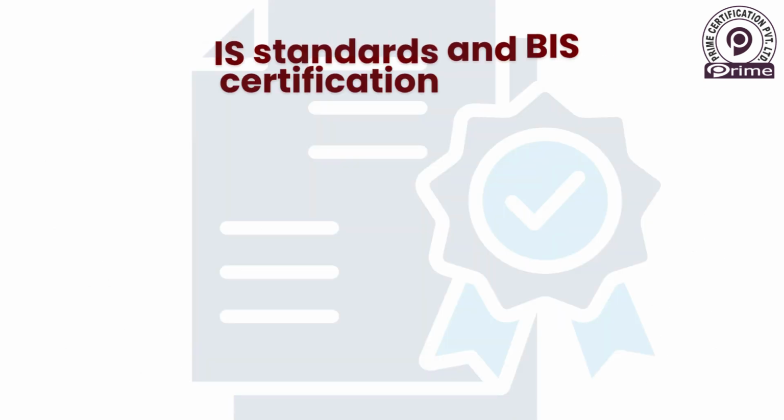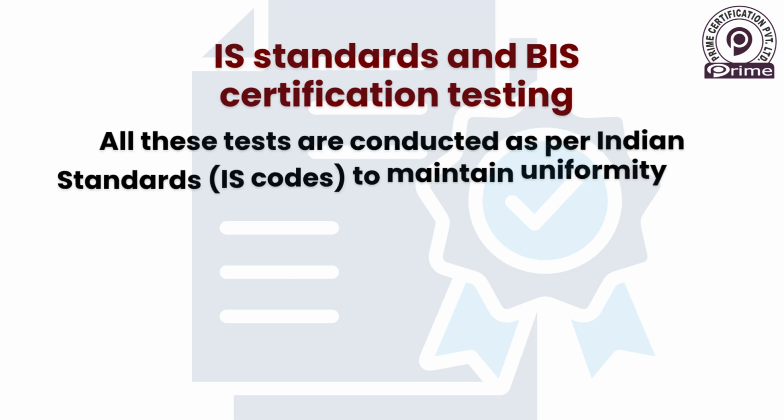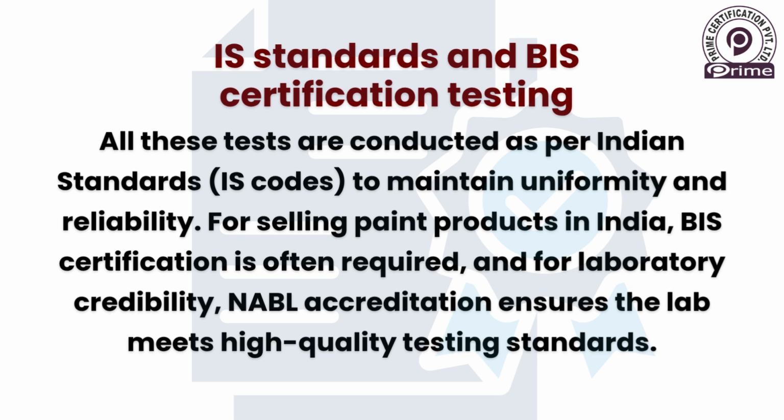IS standards and BIS certification testing. All these tests are conducted as per Indian standards, IS codes, to maintain uniformity and reliability. For selling paint products in India, BIS certification is often required, and for laboratory credibility, NABL accreditation ensures the lab meets high-quality testing standards.